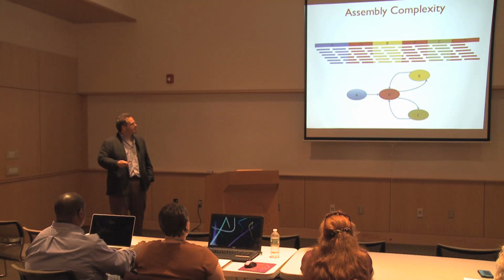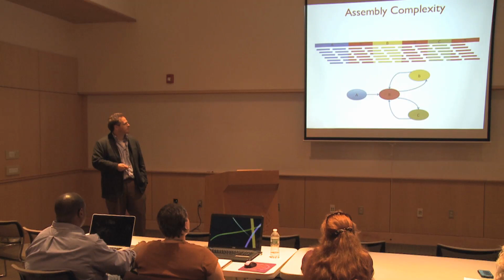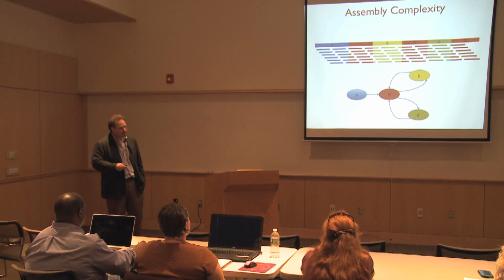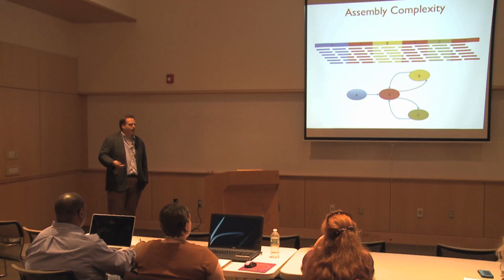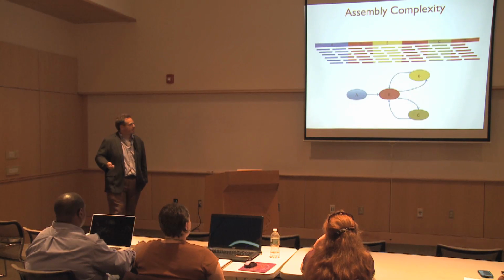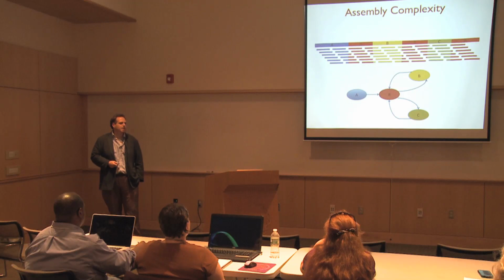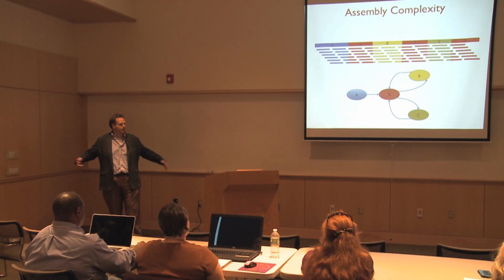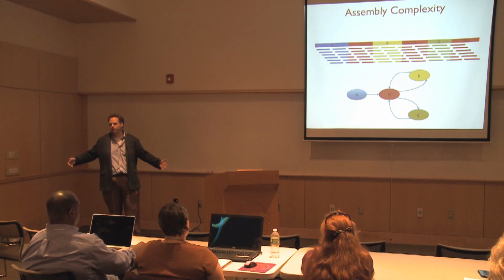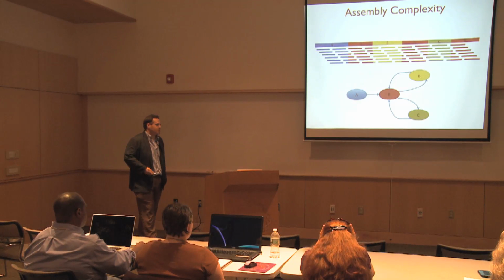So in principle, all the information in the assembly, in the genome, in the transcriptome is present. It's just not clear how it should be represented. So from this assembly, the assembler would probably output 4 different contigs representing these 4 different segments along the way, which, depending on the type of analysis you're doing, could be okay. But if you want a global analysis of the chromosomes or of individual transcripts, we need to add in some sort of extra information.